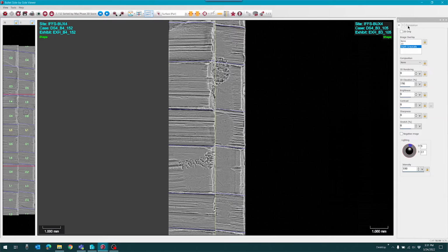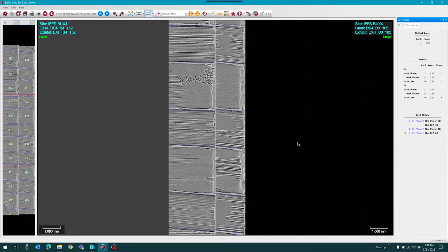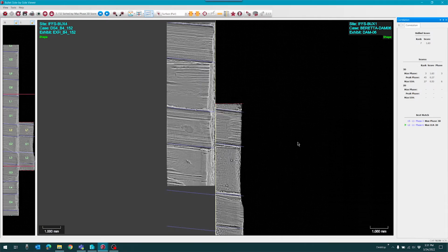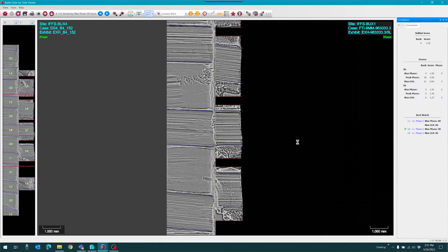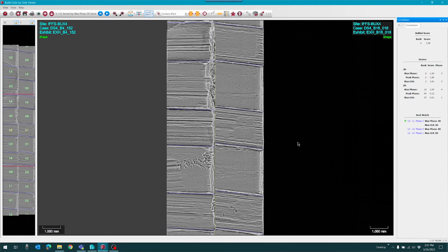I'd actually want to turn on the correlation here again, because I do like to glance over, look at how many I have to do, and then I look at the middle of the screen, I go through those, and then I hit the down arrow, glance over at how many best matches there are, and work through it like that. And so that becomes a very fast way of working through, screening through your correlation results for bullets while using the side-by-side compare screen.